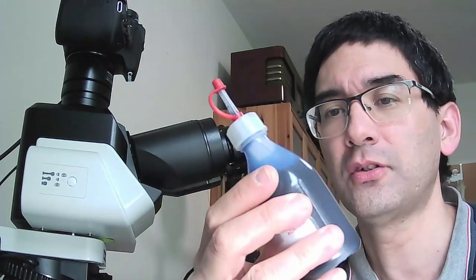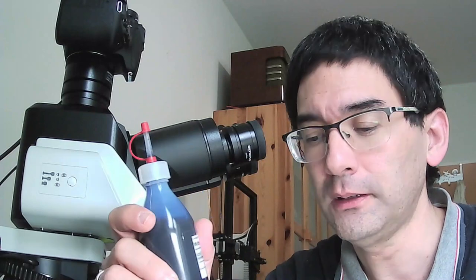Now let's do the following. Let's repeat the whole thing, but this time I would like to stain the cells with methylene blue, and then we're gonna look at it again on the bright field. And what I would like to do, however, differently is the following. I'm going to add the methylene blue after I put the slide on the microscope. And the reason is I want to show you how the methylene blue actually spreads across the slide, and how then the cells will absorb the stain.